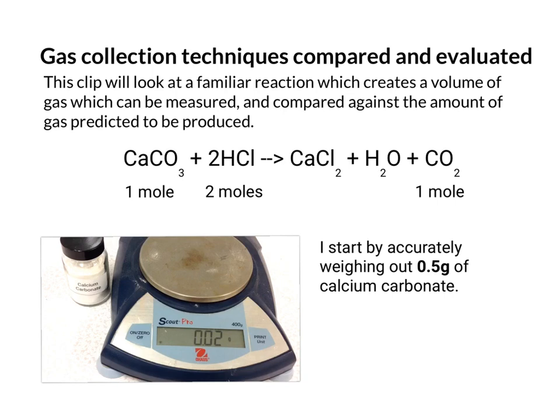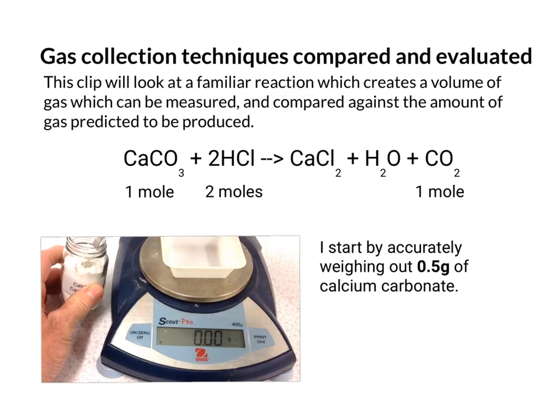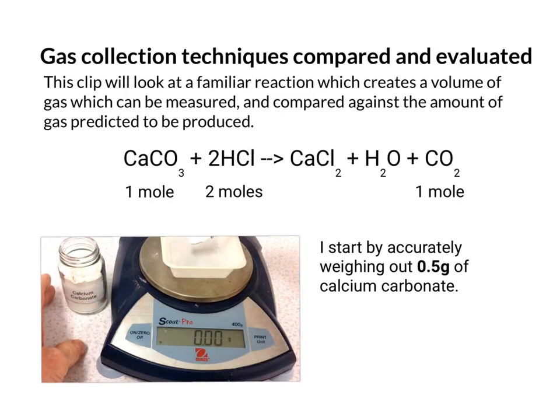So I start by weighing out 0.5 grams of calcium carbonate. So I zero my weighing boat. I just have to add my calcium carbonate to the weighing boat. I'm aiming to be as careful and precise as possible here, not spilling any. I'm carefully tipping it in bit by bit until we get to 0.5.